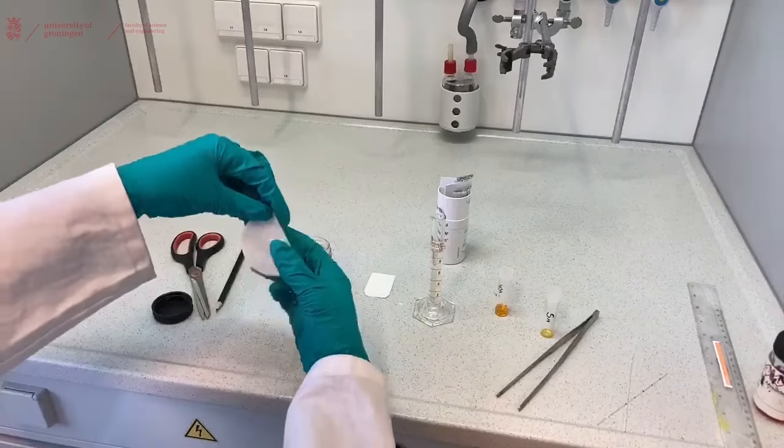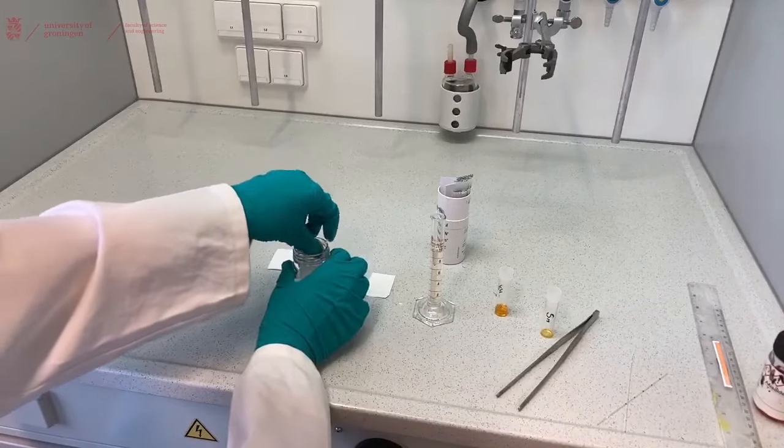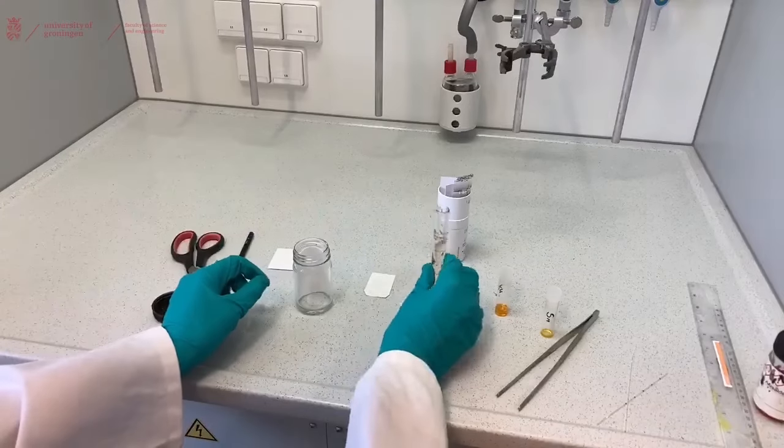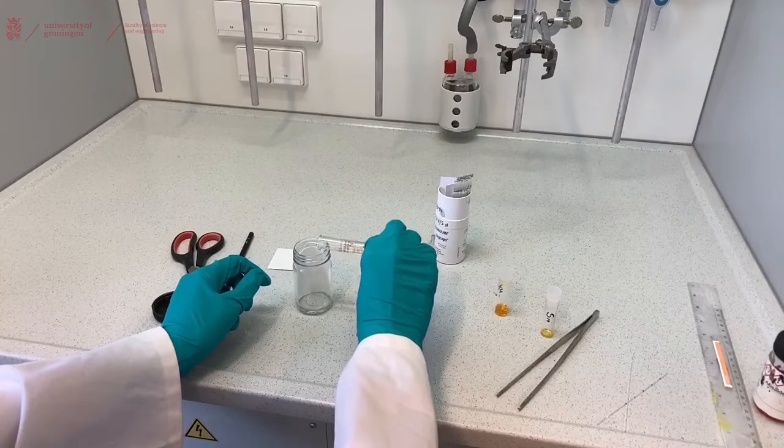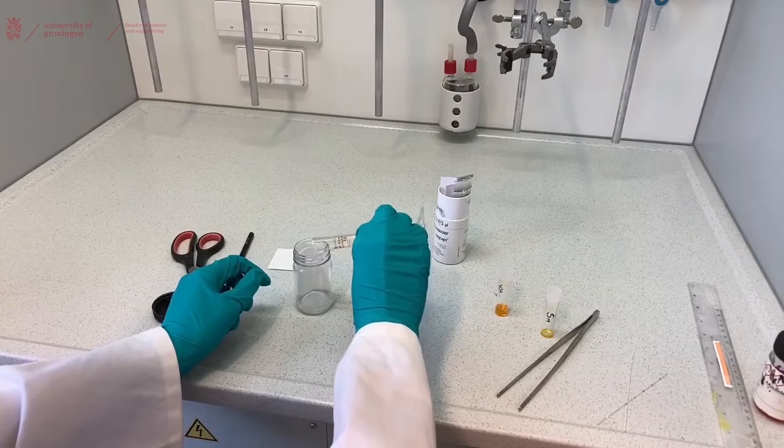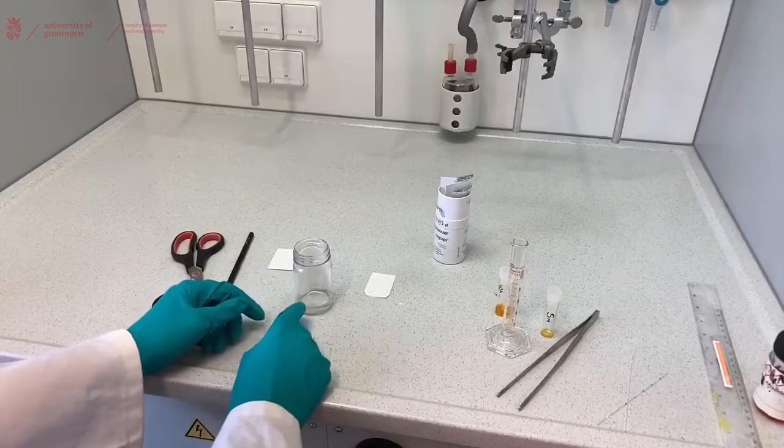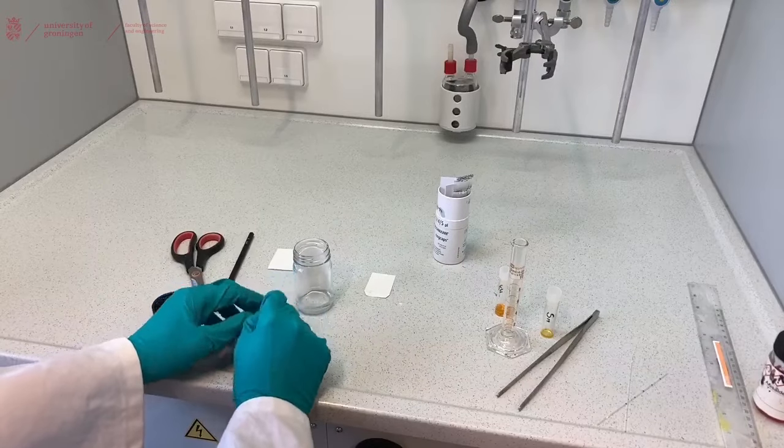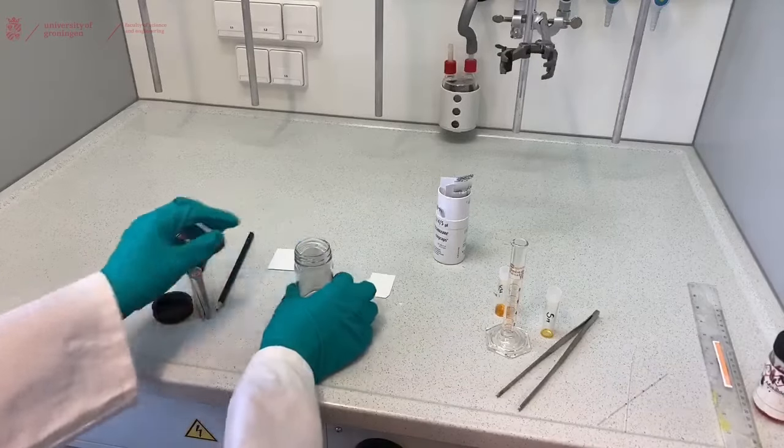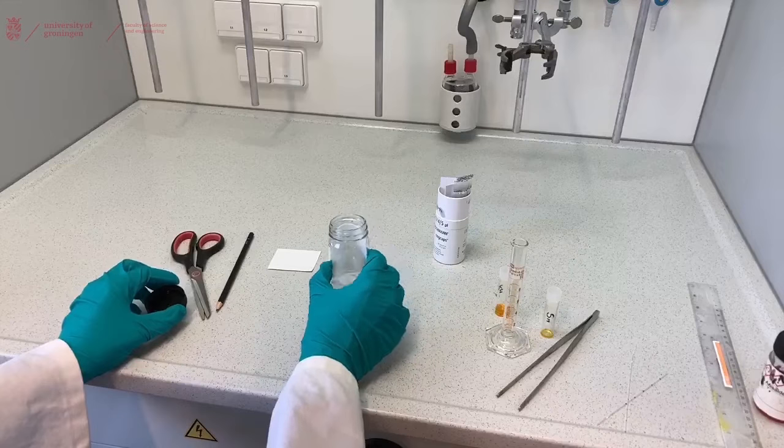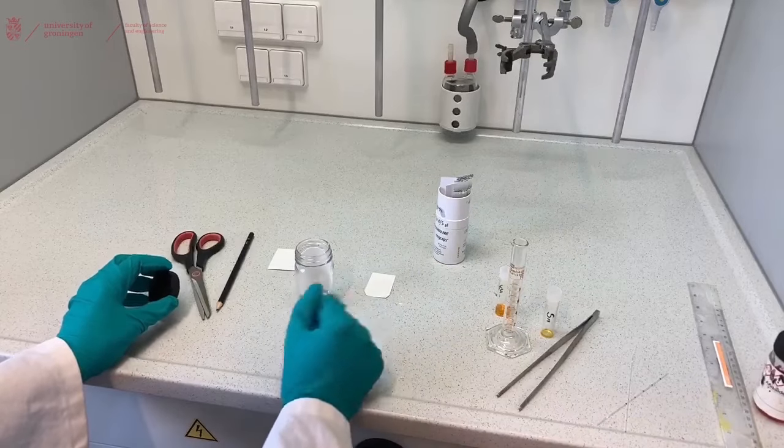Place the filter paper in your jar and pour in the solvent. The filter paper will pull the liquid up into the jar and then fill the whole jar with the vapors of the solvent, making sure you get a nicer separation.